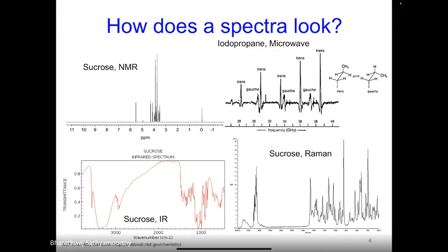Let me try to quickly show you. Unfortunately, I don't have an expansion of NMR signal. We're going to have very sharp signals in NMR where the line widths are within, say, 1 to 2 hertz for a small molecule. Actually, it should be less than 1 hertz if you have shimmed well. But basically, it's very narrow. But on the other hand, you're able to realize for a rotational spectrum of this sort, you're appreciating that the line width is in the order of few gigahertz. You're already able to understand the line widths are quite different.